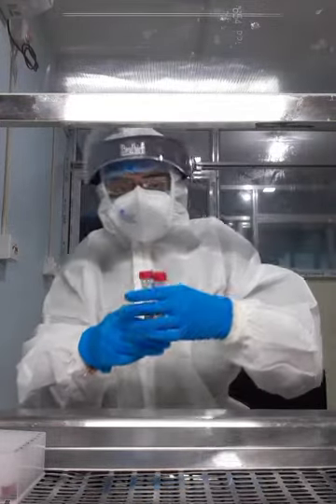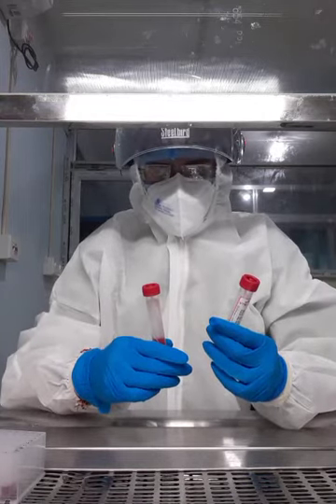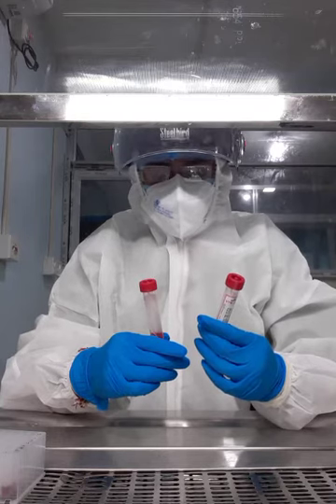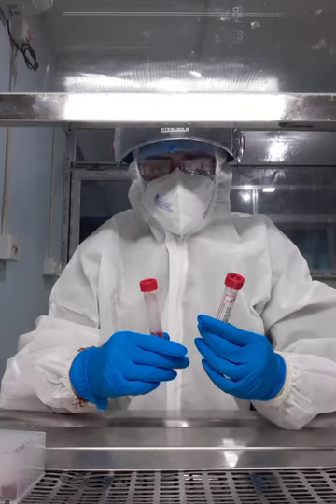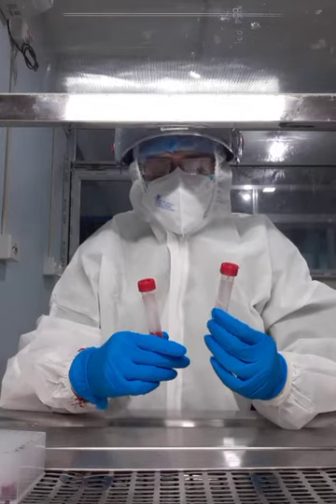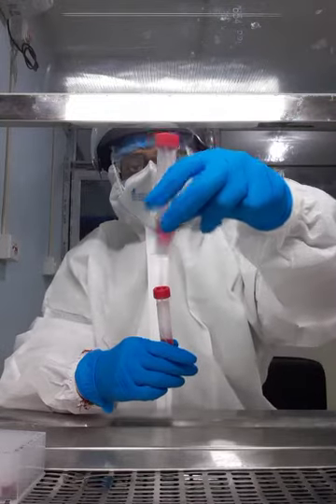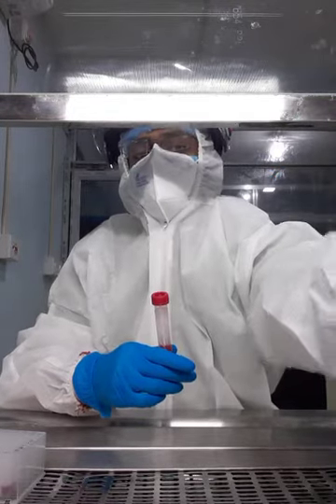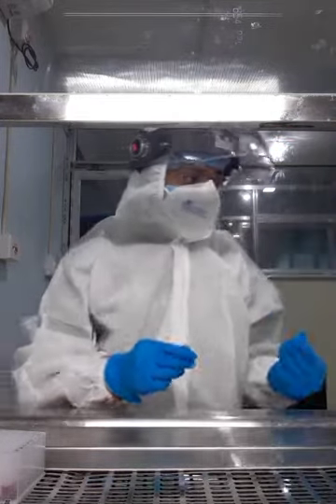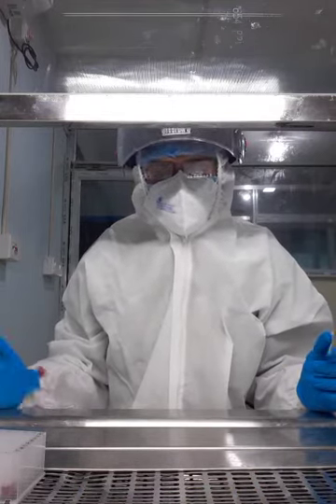This is the VTM sample. Here you don't know whether the patient is positive or negative for SARS-CoV-2 or any other viruses. This is the VTM sample of the first person, I keep it here. This is the VTM sample of the second person, I keep it here. I am using these two VTM samples for a test, so I do not take any note.